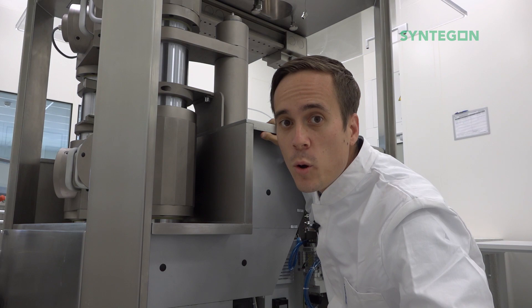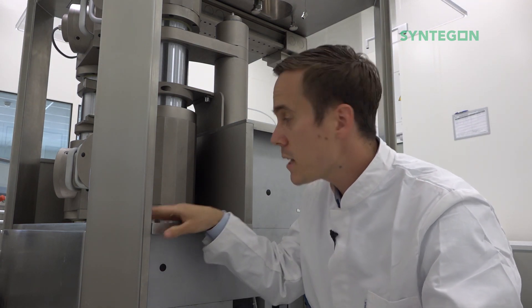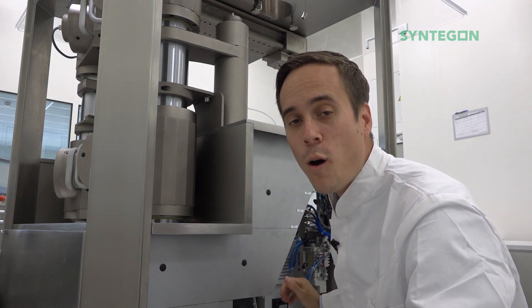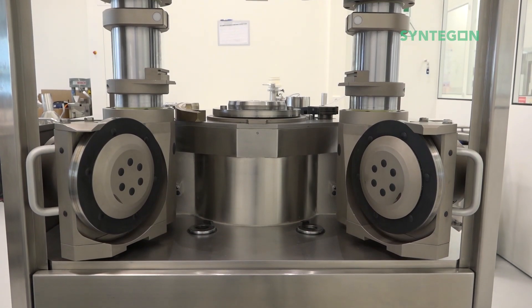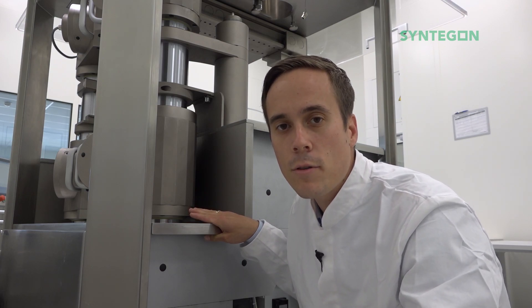In order to further improve the cleanability of the machine we came up with the step design of the TPR. This way we can keep the lower compression rotors in the processing zone and therefore have a completely sealed area. That means the processing zone and the mechanical area below are completely separated. This also helps with the fact that there's almost no heat transfer from the drive to the processing zone above, and of course no powder can reach down into the drive section.